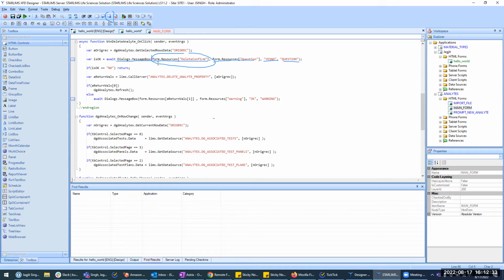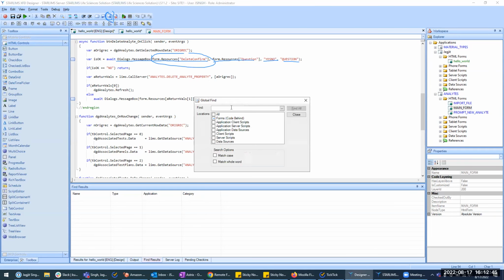It's just not what I want to see right now. So let's find another one, or do this here. Let's see what else we got. Yeah, let's see what else is in this form.